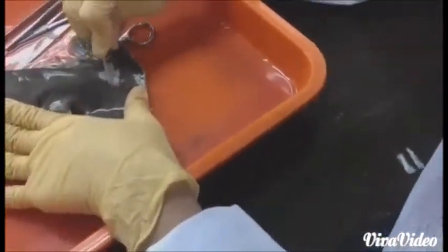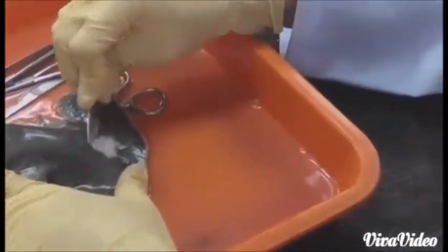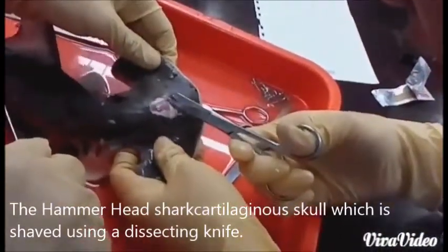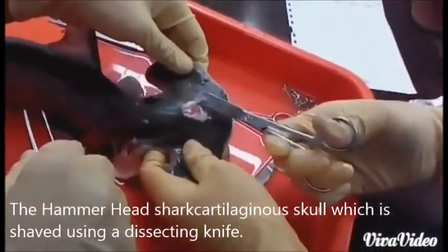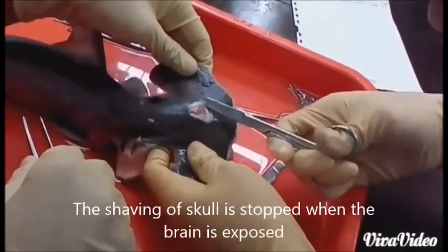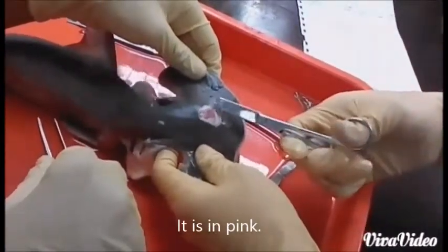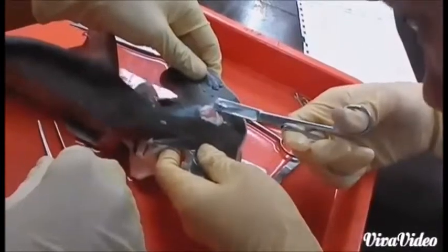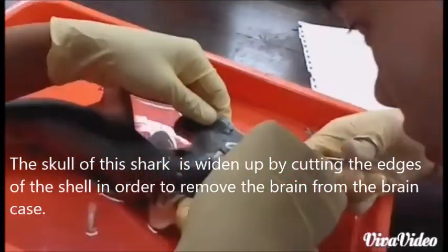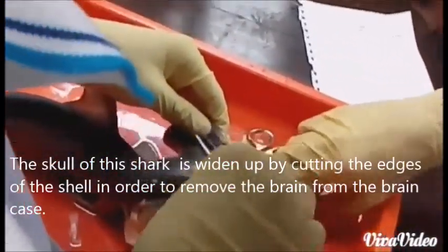The hammerhead shark has a cartilaginous skull which is shaved using a dissecting knife. The shaving of the skull is then stopped when the brain is exposed. As you all can see, it is bright pink. The skull of this shark is widened up by cutting the edges of the skull in order to remove the brain from the brain case.